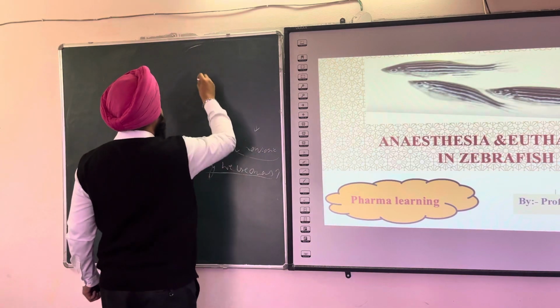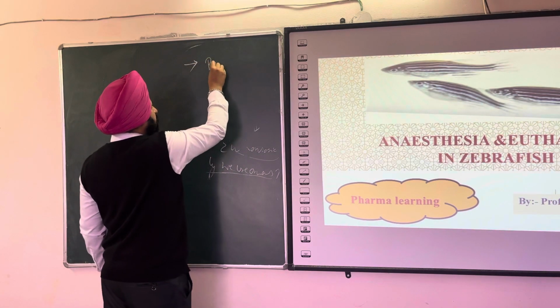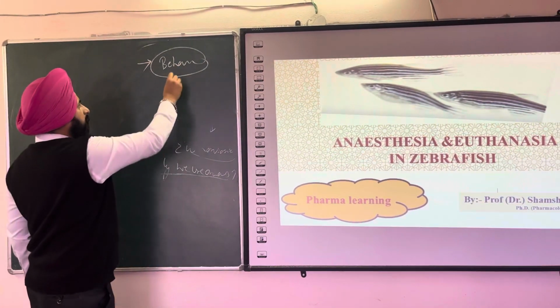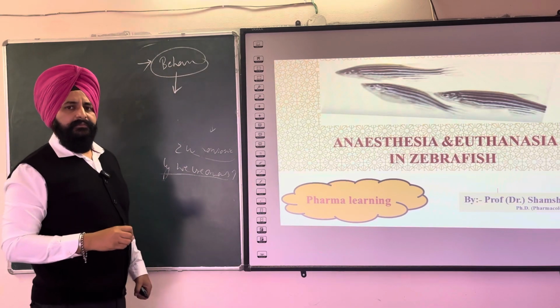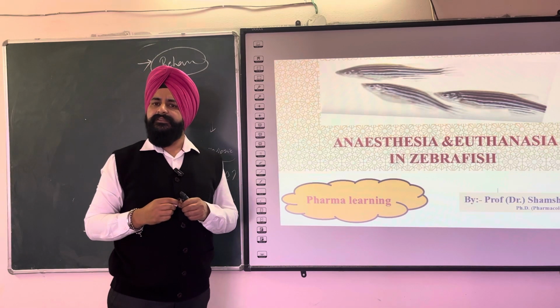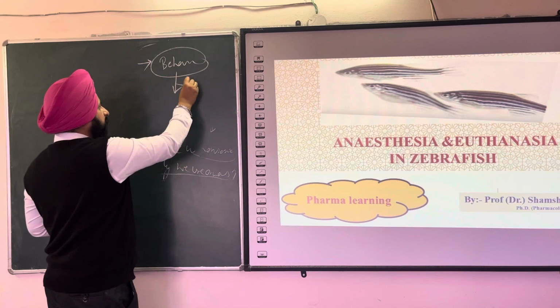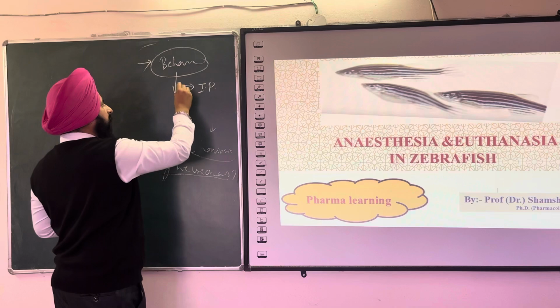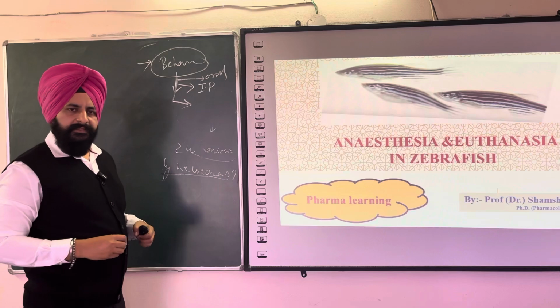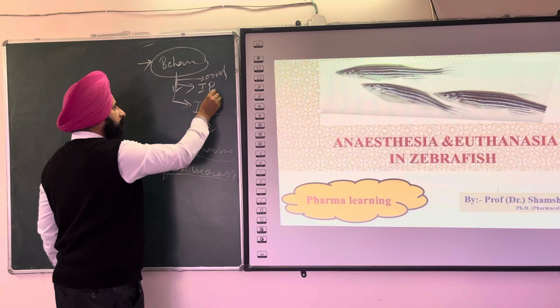Suppose you want to note down the behavior of the zebrafish, and you are thinking of giving some kind of anesthetic because you want to orally administer a drug to the zebrafish, or inject a drug intraperitoneally, or you are doing surgery in which you are giving an injection intracerebroventricularly.